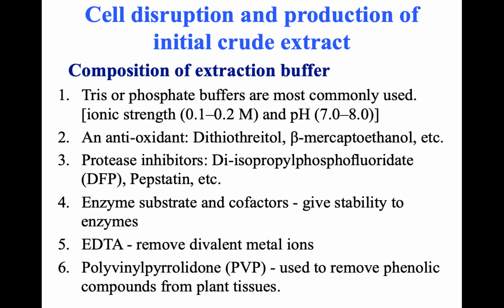In addition, we can also use the enzyme substrate and the cofactors. Enzyme substrates bind to the enzyme's active site and stabilize the enzymes. At the same time, cofactors also give stability to the enzymes, and they are also helpful in screening the column fractions for enzymatic activity.